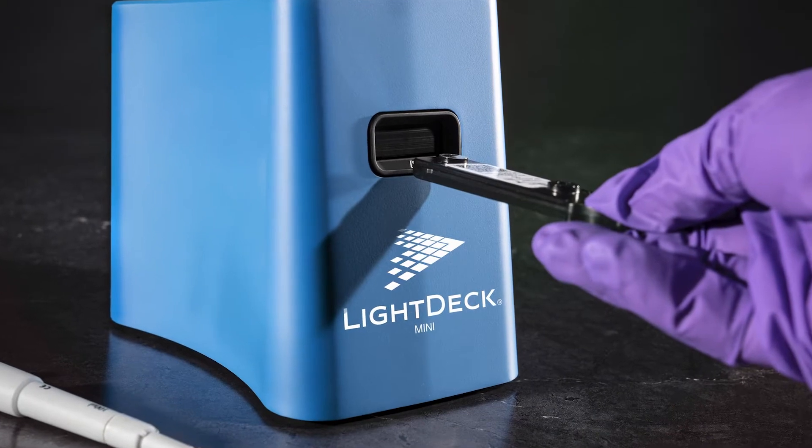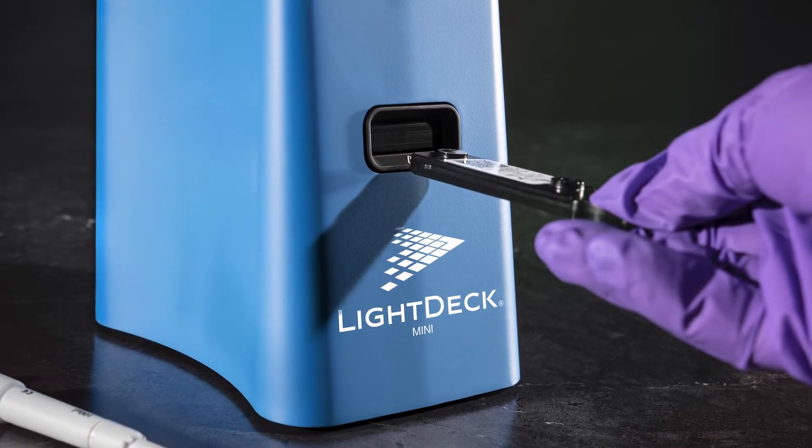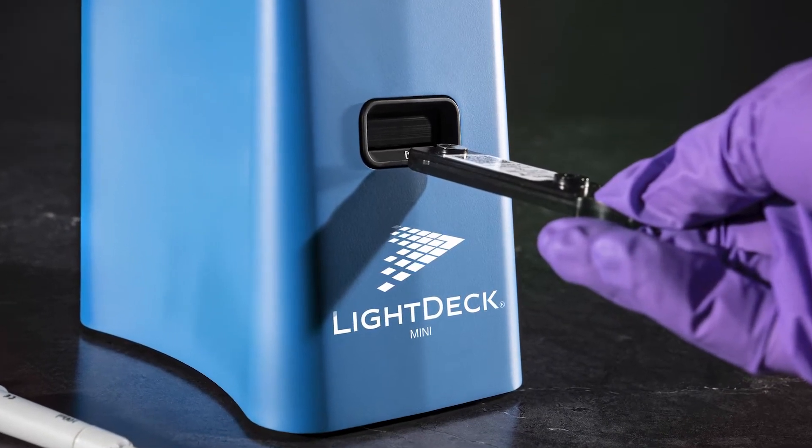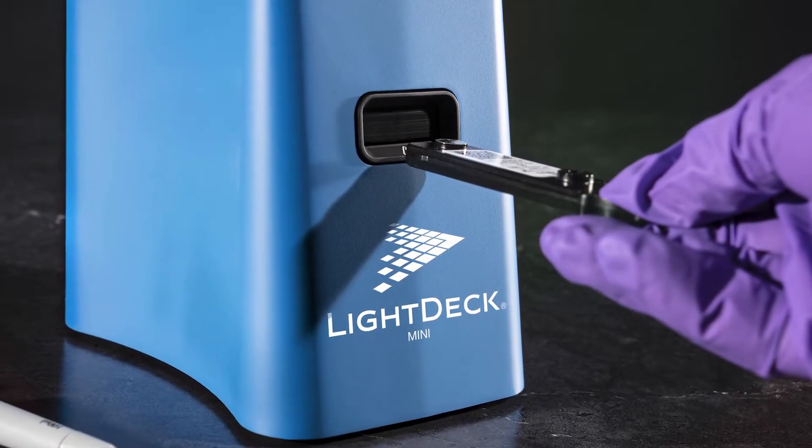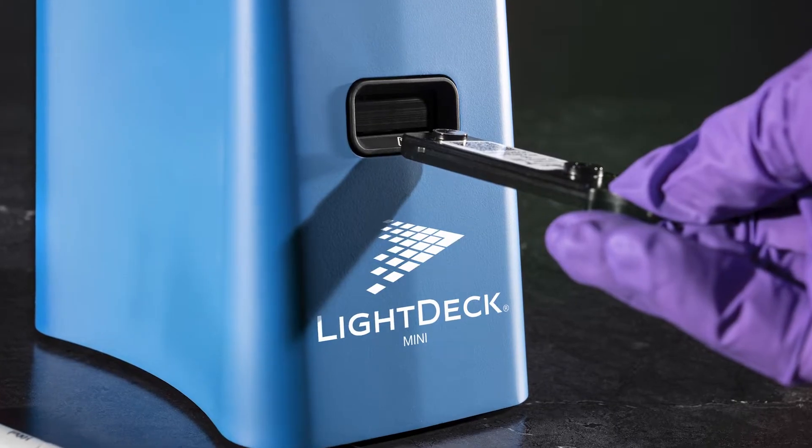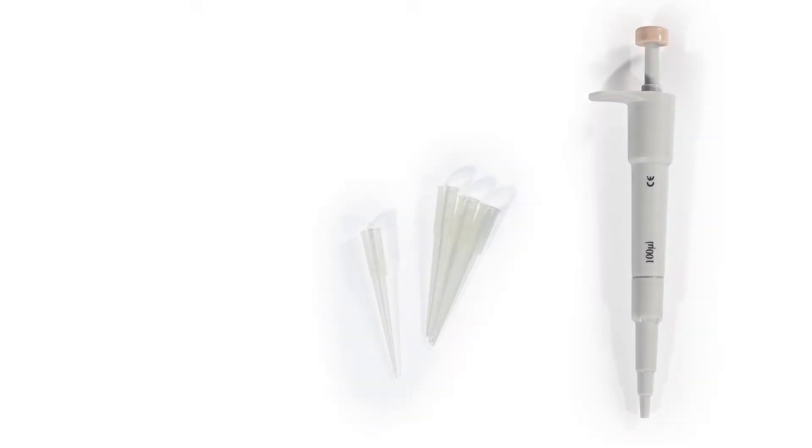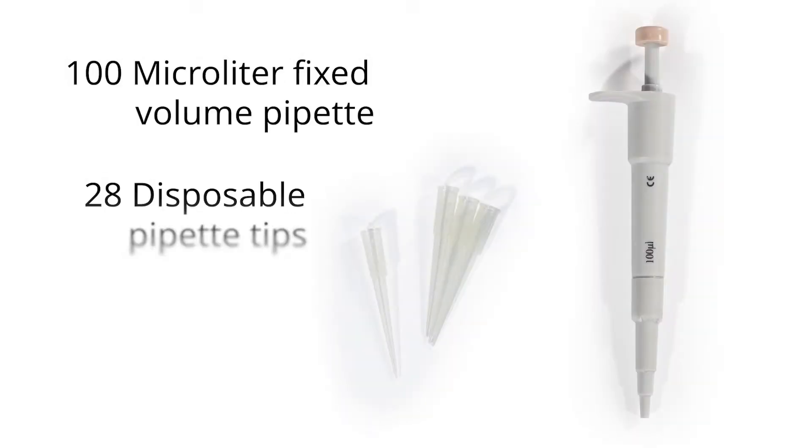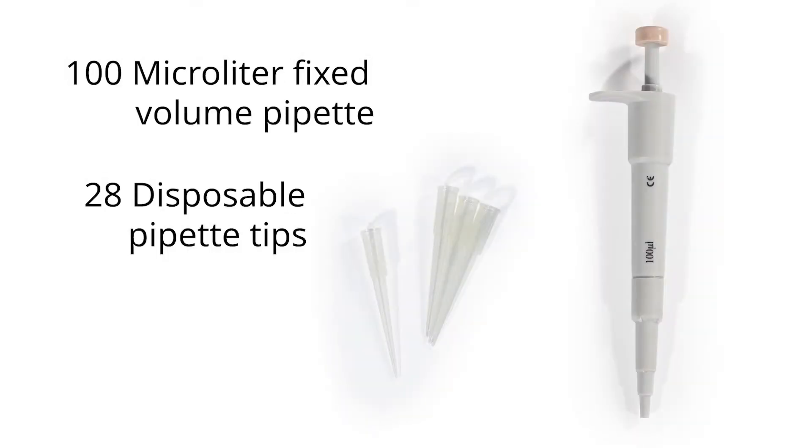This instructional video will show you how to properly run samples with the LightDeck Mini and its disposable test cartridges.